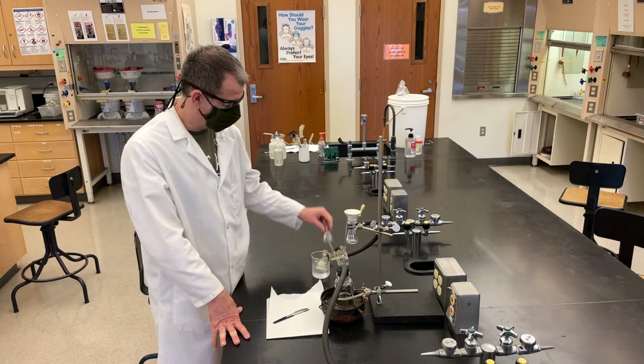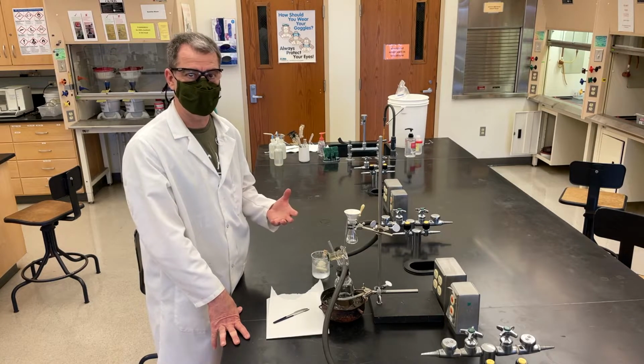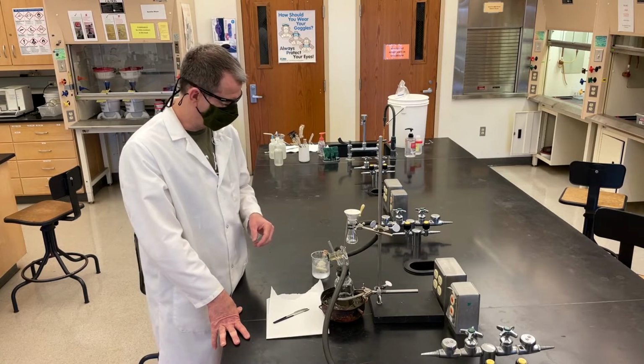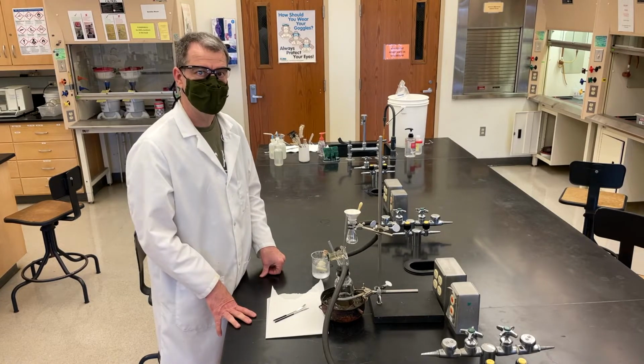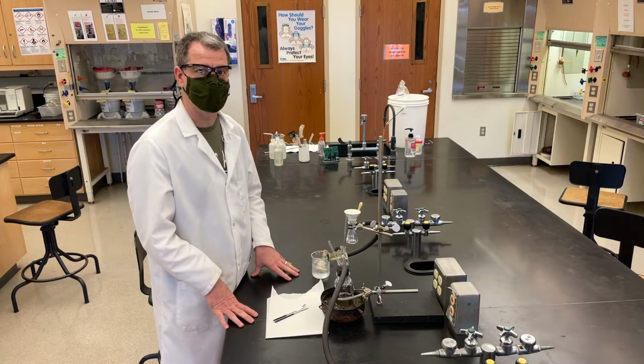I've got a little bit of DI water here that I'm going to rinse those crystals with. We're going to rinse it with about 3 mils of DI water. I'm going to ice that down as soon as I start to filter the crystals. I've got some pipettes here and some spatulas and some other things to help me do that transfer. And I'm going to move the camera, zoom it in, and we'll see how this all goes.